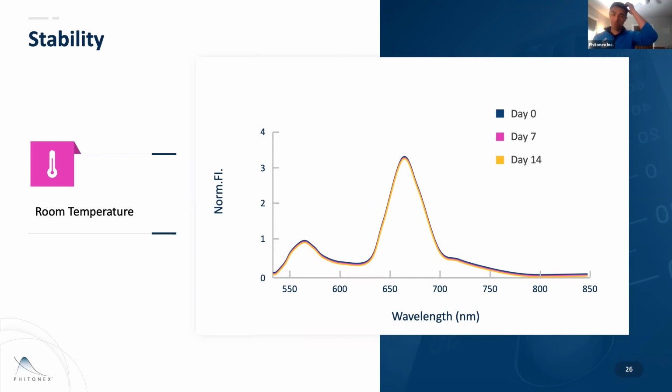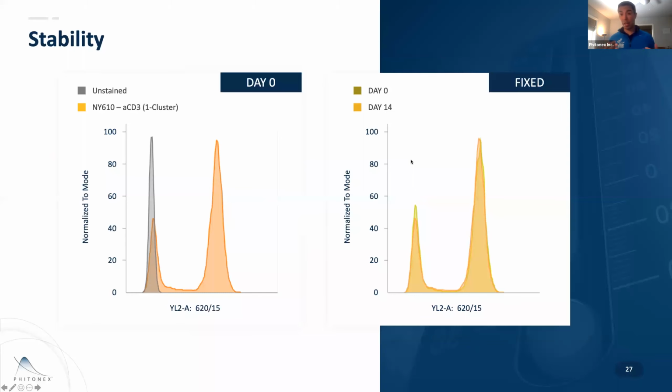So we've seen some interesting results on this. We're testing some of the photostability right now, but you can see that the physical stability of these is really interesting. So let's push that. Let's push that physical stability. How stable are these things? So we did what I think is an interesting experiment, and honestly chemically abusive to fluors.